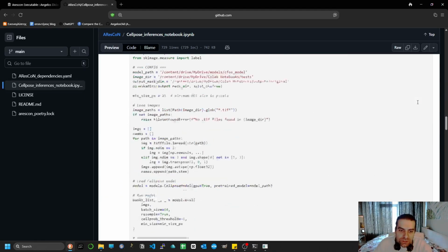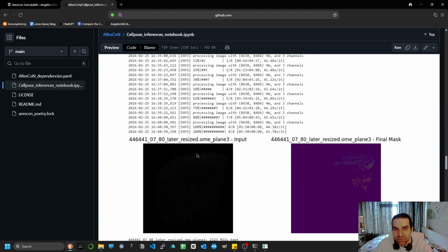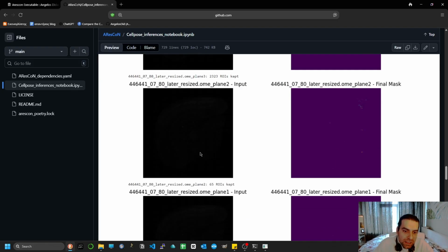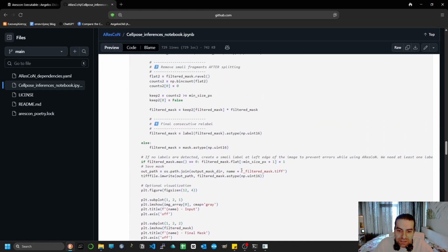This one I also used a bit of AI to produce some code here, so it might not be the original file of the people, but all the information is taken by the AI from people using CellPose. What's important here is that there is this filter mask insertion to the names that I use to prevent getting names overridden in Google Colab in case there is a wrong option of directories. So for that, you just need to delete the filter mask from every image.